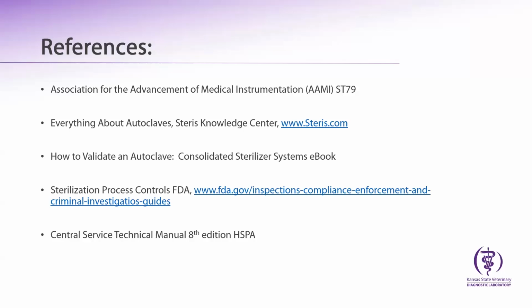Come on, come on. And I know that those of you that are not in here cannot see us, so what we're doing is we are taking some small self-seal pouches. And we are using a chemical indicator. This one is actually a class 4. This is one of Proper's. So we're sliding this into our pouch. And then we're taking a biological and sliding this into the pouch.